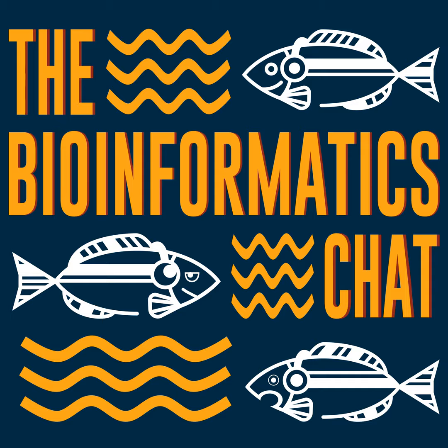But I imagine you wouldn't want to be lazy and just fill everything with A's or everything with T's, right? Because I hear nanopores have an especially big issue with homopolymers, so you want to fill that with something high entropy. Now, interestingly, the issue that nanopores have with homopolymers is only with basecalling. Because of the stochastic variation in dwell time of each base, they can't really tell if it's maybe 3 A's or 4 A's. Now, we don't have a problem with that here.